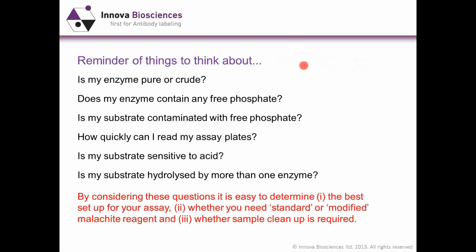A final reminder of things to think about if you're going to use malachite reagents: Is my enzyme pure or crude? Does my enzyme contain any free phosphate? Is the substrate contaminated with free phosphate? How quickly are you going to read your assay plates? Is your substrate sensitive to acid — ATP and GTP are particularly sensitive. And is your substrate hydrolyzed by more than one enzyme, which is important if you have a crude sample? If you think about these things, it's fairly easy to get the best setup for your assay and determine whether any sample cleanup is required.